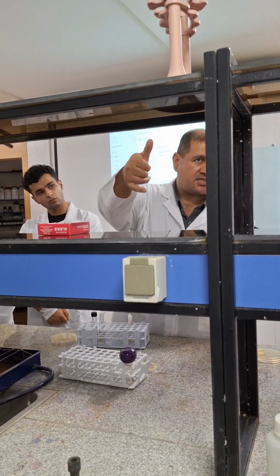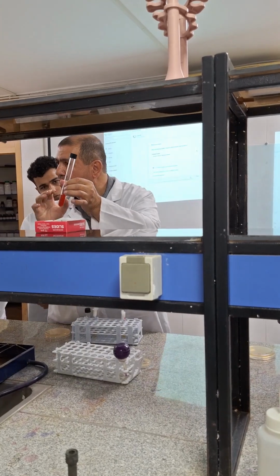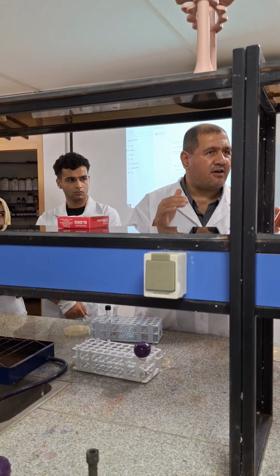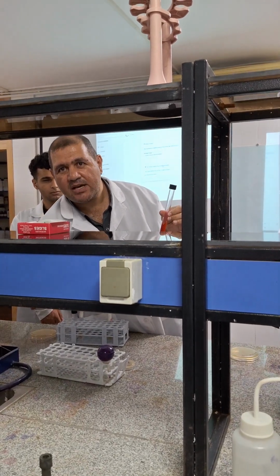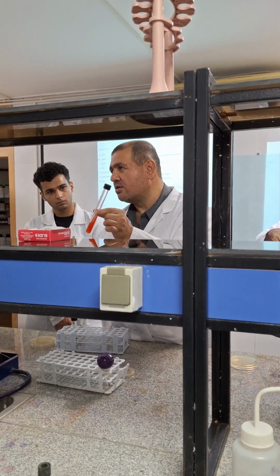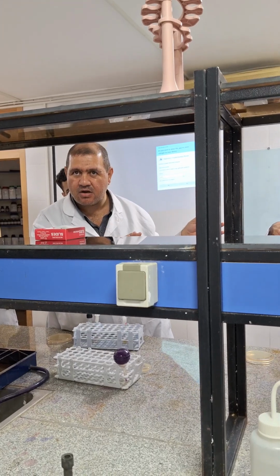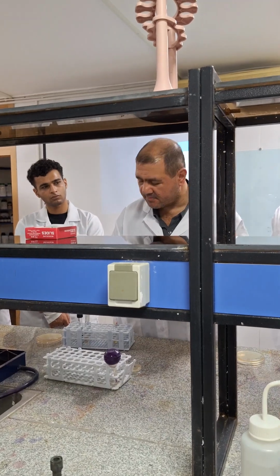The fourth group of culture media is differential media, such as mannitol salt agar. This medium contains mannitol. I told you all Staphylococcus can grow on this medium, but only Staph aureus ferments mannitol and changes the color of the medium from pink to golden yellow. So according to this reaction, you can identify Staph aureus from coagulase-negative Staphylococcus. So it's differential media or indicator media. You understand?